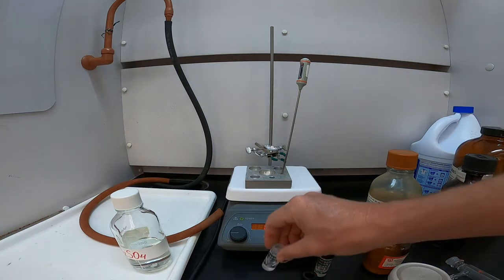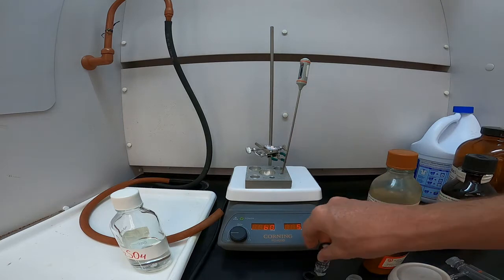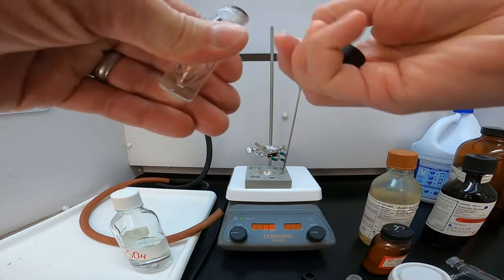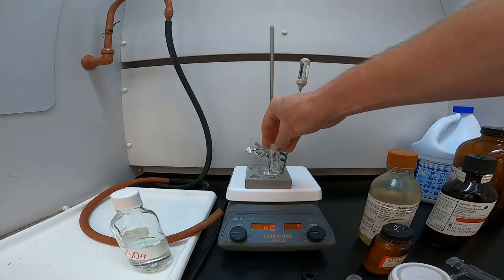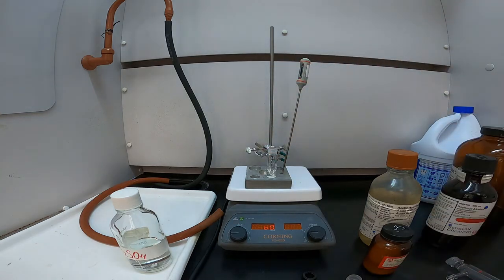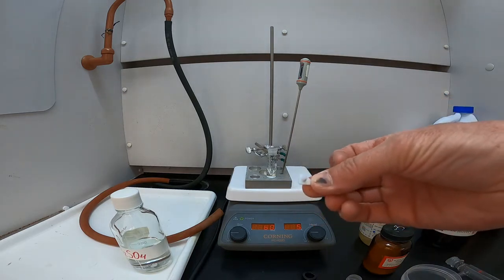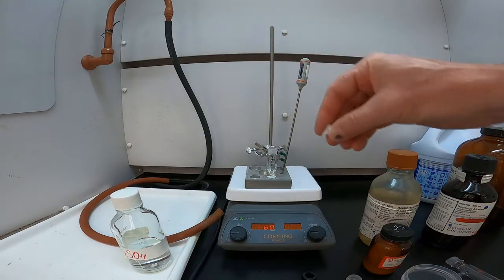It includes using a microscale 5 milliliter conical vial that will heat on the aluminum heating block. Within that, we can also put a miniature magnetic spin vane. So just like a magnet on a stir plate, this little magnetic spin vane is V-shaped to fit in the bottom of the conical vial.